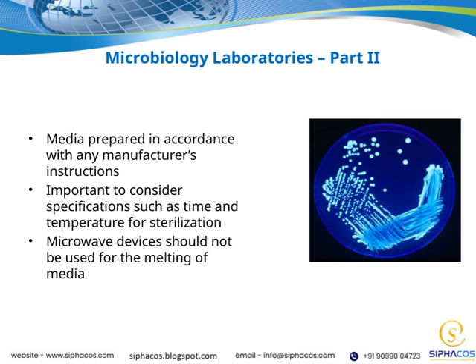Additionally, I want to highlight that microwave devices should not be used for melting media. Microwaves can cause uneven heating, which might compromise the media's sterility or other properties. Instead, we should use appropriate sterilization equipment to achieve uniform and safe results. All of these points tie back to our overall goal, maintaining the quality and reliability of our microbiology work. Proper media preparation and sterilization are foundational to accurate microbiological analysis.